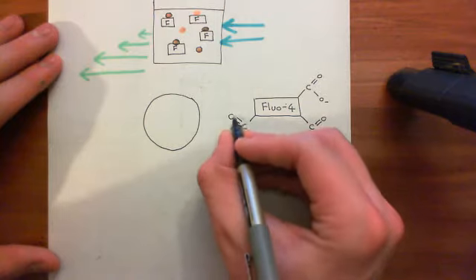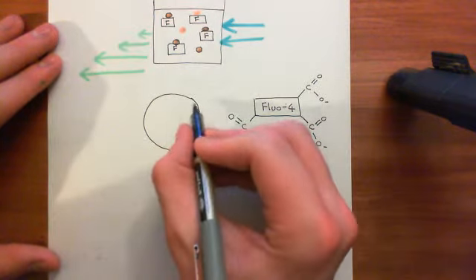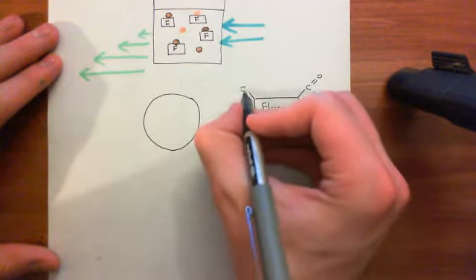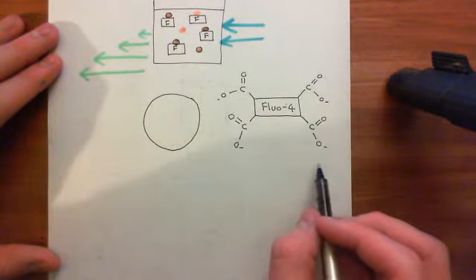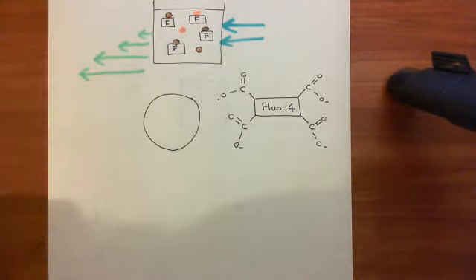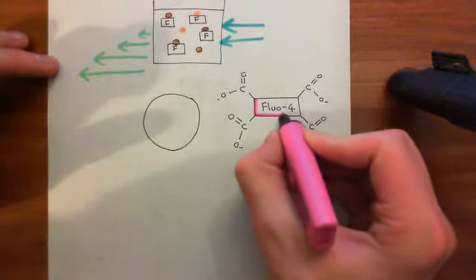You see, the problem is that the cell membrane is a layer of phospholipids. It's extremely hydrophobic. This molecule has got 4 negative charges, and even if it binds a calcium ion, it's still got 2 negative charges overall. That is not going to be able to get through a cell membrane. So we're confronted with this problem that Fluo-4 isn't actually going to get into cells even if we pour it on top of cells.